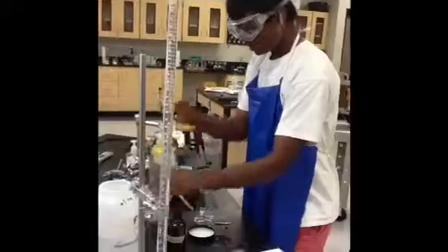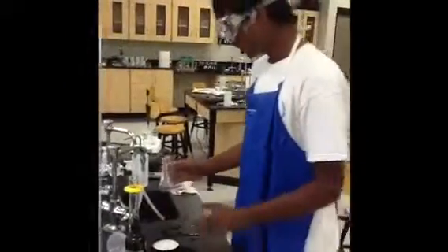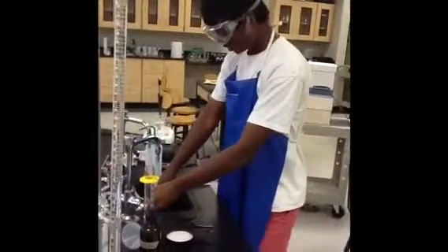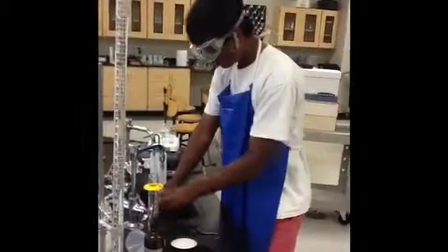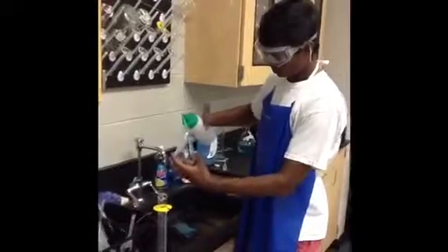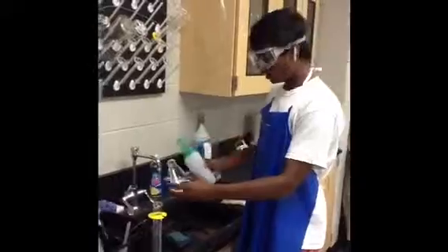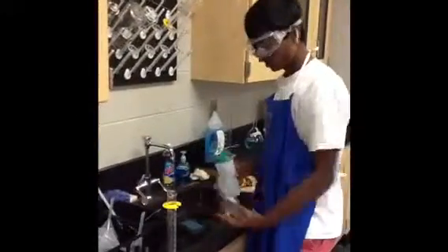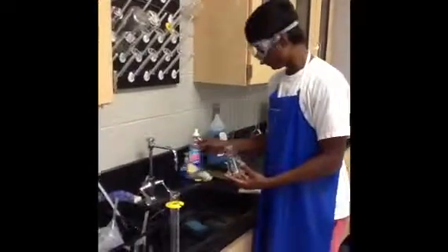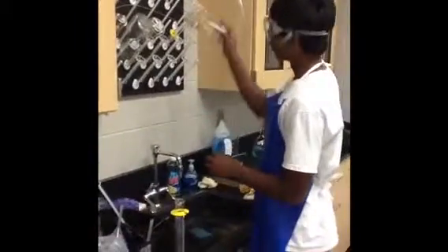And drain it in. We should also clean it up with water. Just rinse it out, kind of lightly. So now this is the cleanup procedures. We should clean it up with distilled water, swirling it all around so all of it is clean, and pouring it out. We should also use some soap. And after you're done with that, you should hang it up on the rack.